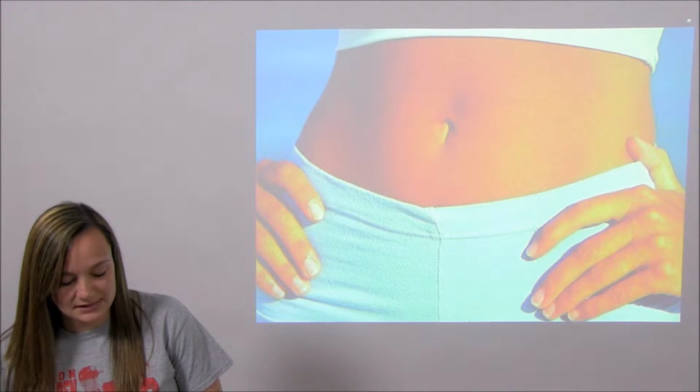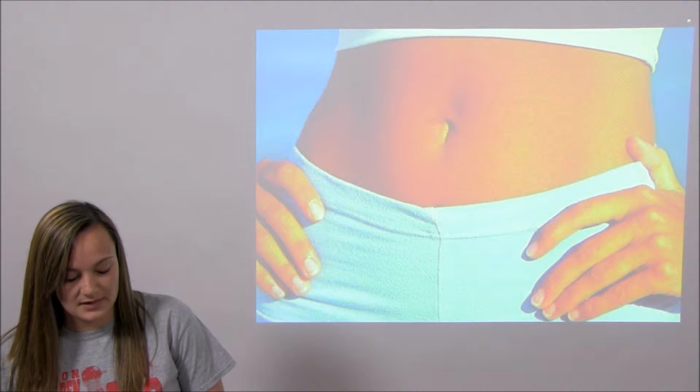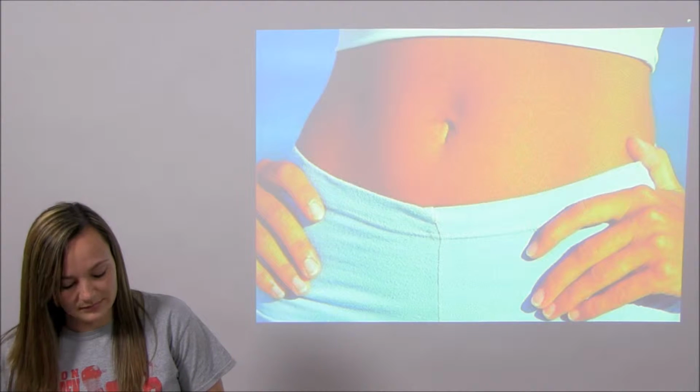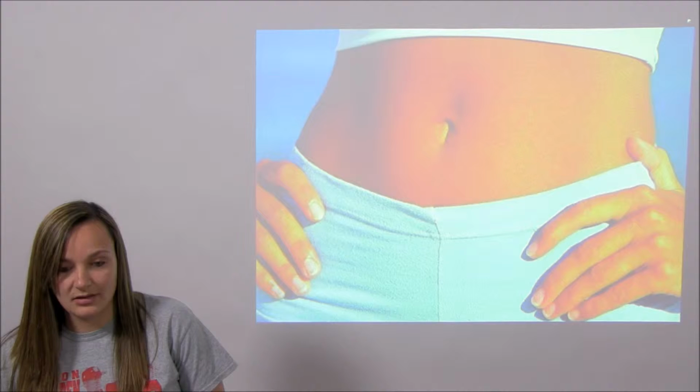In order to detect differences in structure and chemical composition of organisms, a differential stain is used. Differential media detects what different bacteria metabolize. Selective media will tell which organisms favor or inhibit the media.